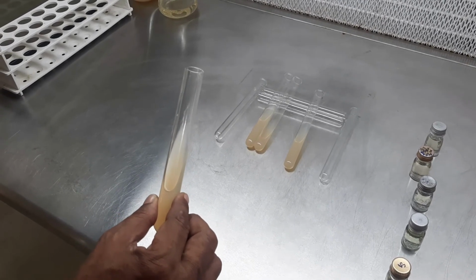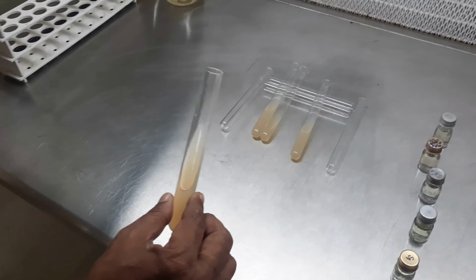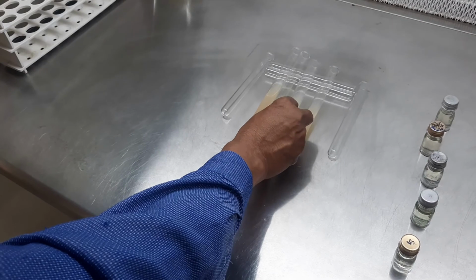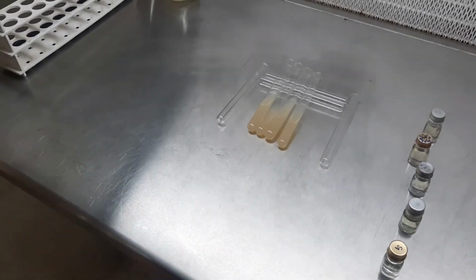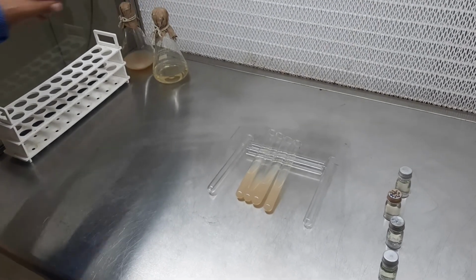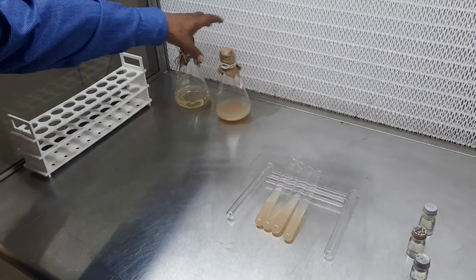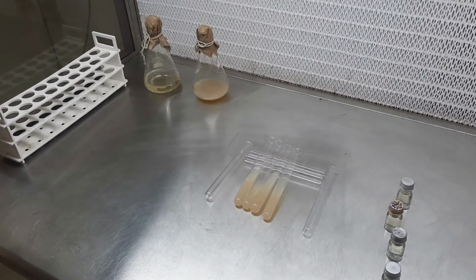But when you isolate or give a colony formation, then these slants are very much required. How to extract the bacteria, that will be taught to you. And you see, this media is solid and this media is liquid. Okay, thank you, sir.